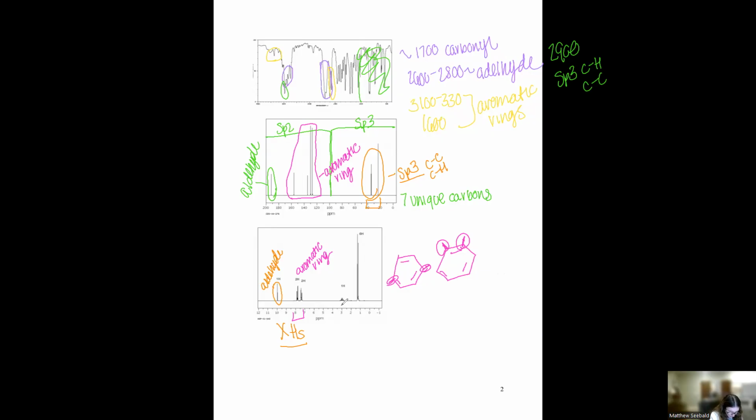Next, at 3 ppm, we have 1H. Although it's pretty unclear exactly how many peaks, I'm confident in saying there are a lot of peaks, which is most likely consistent with a neighboring hydrogen that has methyl groups. Last, let's move to 6H. I know I have 6 hydrogens and 2 spikes, so the neighbor will just have 1 hydrogen.